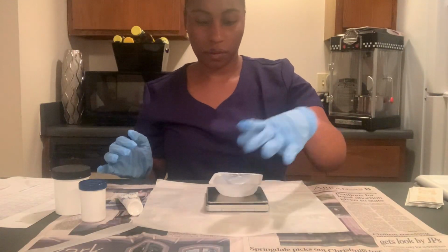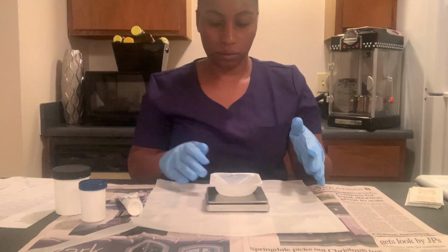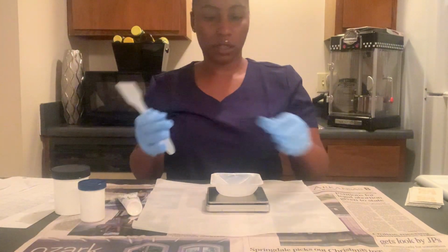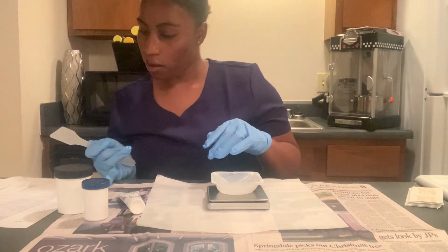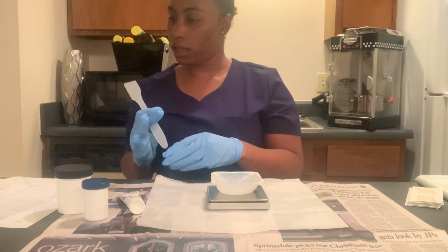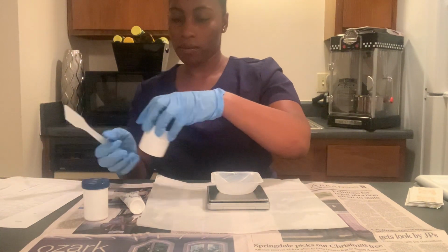Okay. So now we're going to weigh the ingredients. So I need to place this on top of here. Then this. Okay. So now we grab our materials. So we're gonna weigh them. So we're gonna weigh the ointment base first.